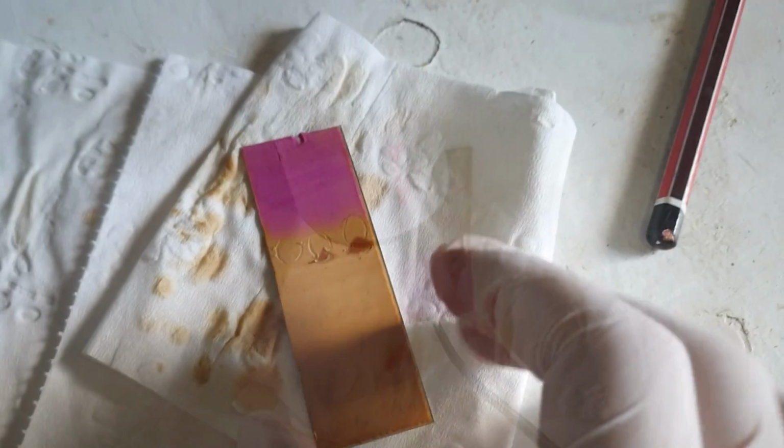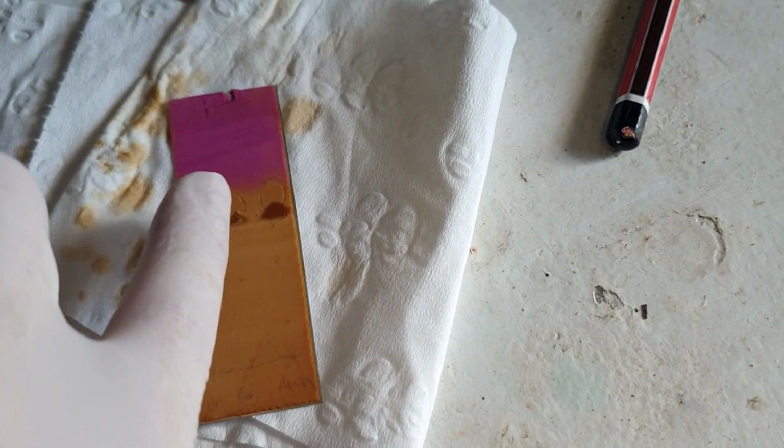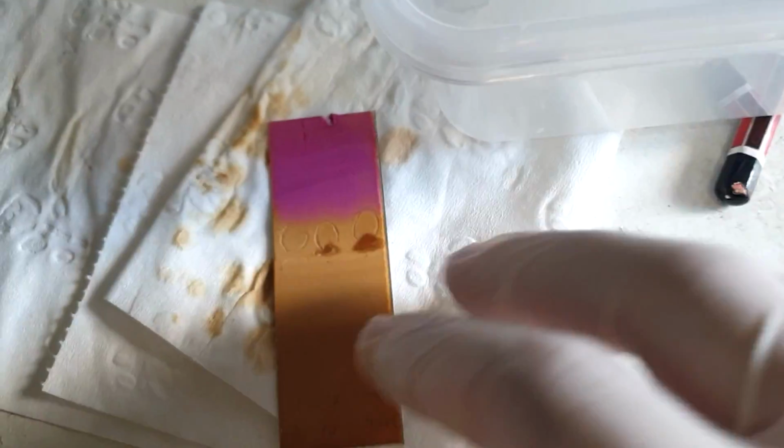I mean, it's sort of working. It sort of doesn't look so good, but earlier you could see those spots a little bit better, and it's good I circled them. The top dots are starting product, there's our co-spot, so there's our two dots, and there's our mixture of our starting material and final product, that lower dot there. So if we consult some of these old TLCs from last time, see that top dot there, our starting material, and then the top dot smudged together with the bottom dot there, so we're able to start separating those two dots out if we make the dots slightly smaller, which we've done.